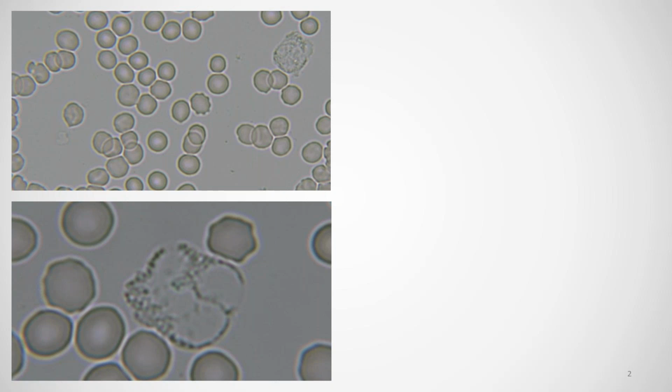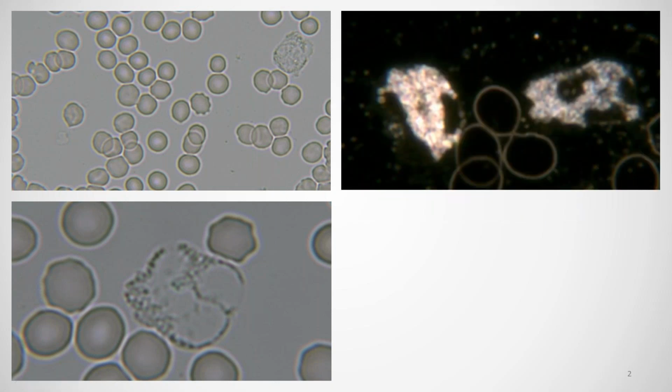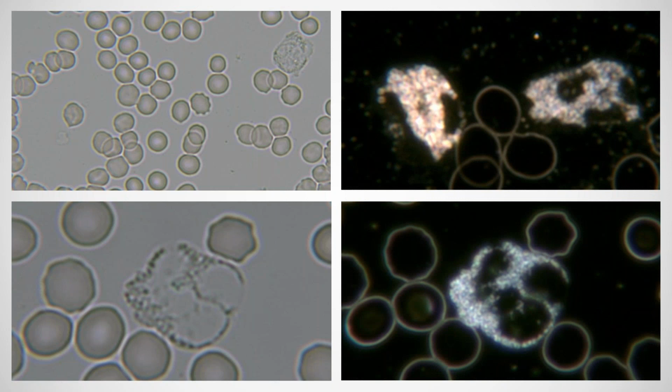Right, a slightly larger view there of a white blood cell and some red blood cells, white blood cell right at the very center there. So at this magnification, we can actually see the structure within the white blood cell here. We can see the nucleus as well as the cytoplasm and the granules in the cytoplasm. Dark field gets very interesting. We're able to see things between the cells in the plasma, and we're able to see a lot more detail in the cells as well. There are a large number of anomalies that are only visible in dark field because of the way that the illumination actually works.